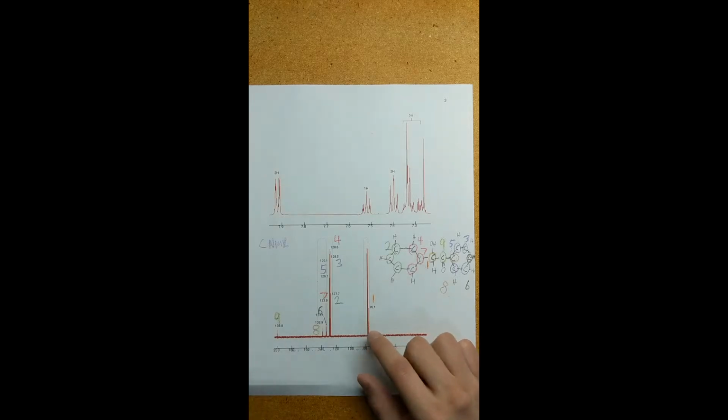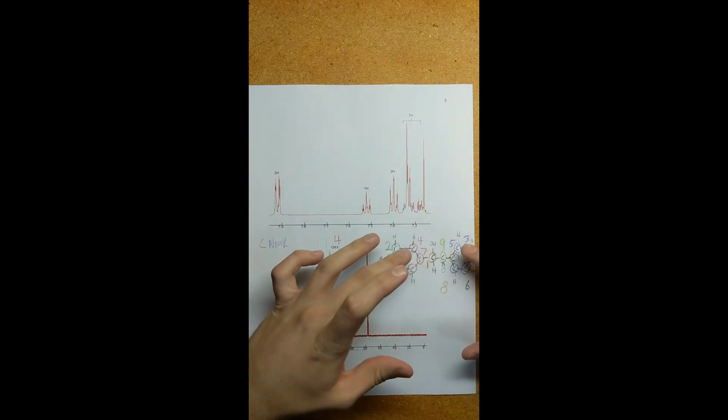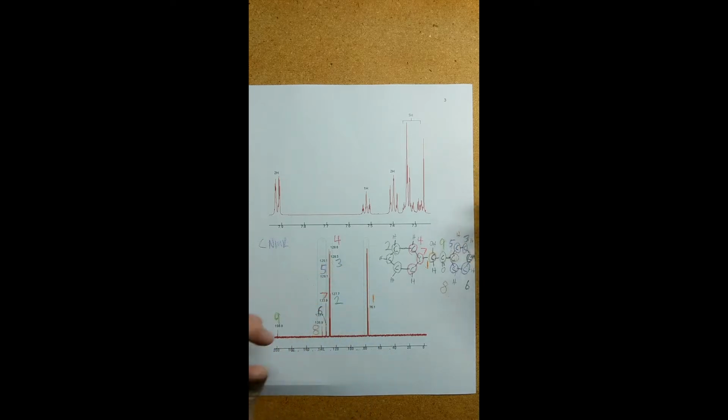So first, starting at the least deshielded position, I chose the carbon that is attached to the alcohol group. Again, this is done because the alcohol group exchanges, as well as due to symmetry in the locations of the cyclic structures here. This points to our being in this 76.1 zone. That matches up well.